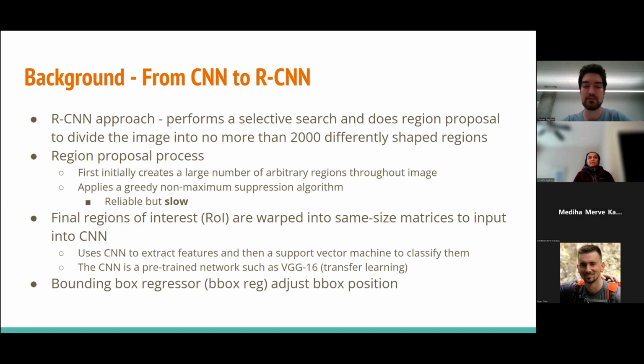One of the most famous ones is VGG16, which is a network that's been trained on a lot of general image data. That's not really specific to any particular application, and has thousands of different objects. So you're limiting how much you actually have to train the network from scratch before you get a good fit. So yeah, that's generally what you run it through. That's the kind of CNN you do after that.